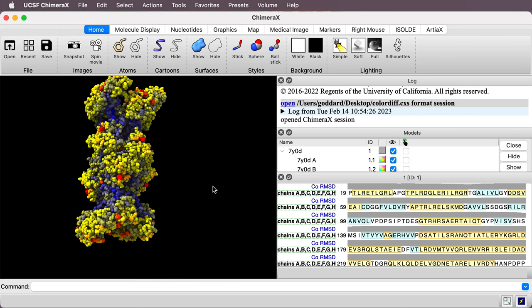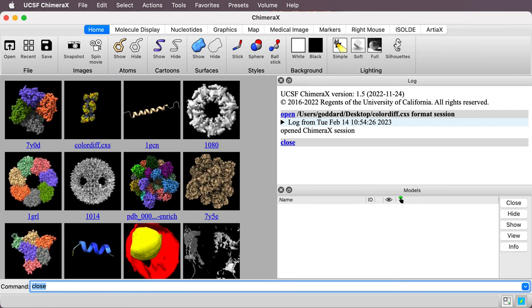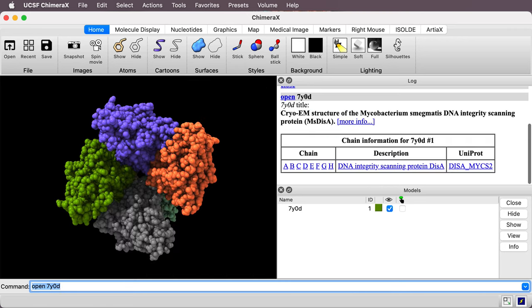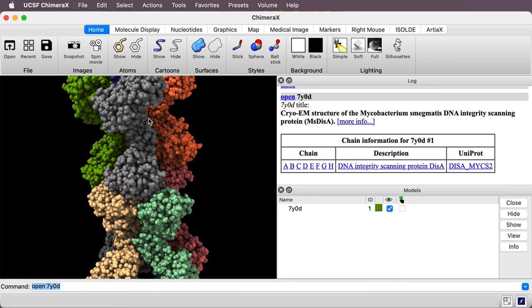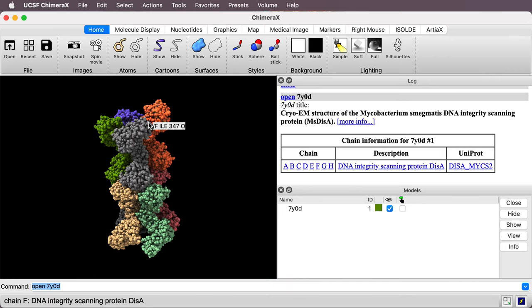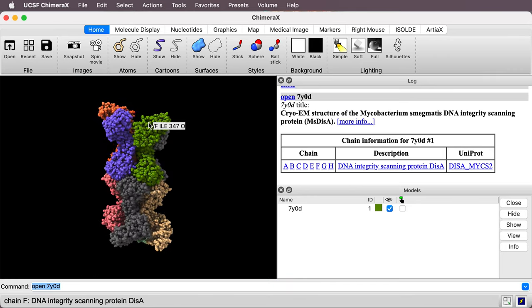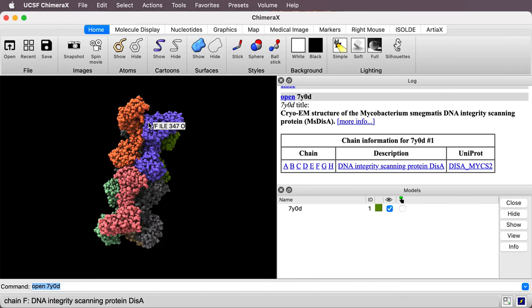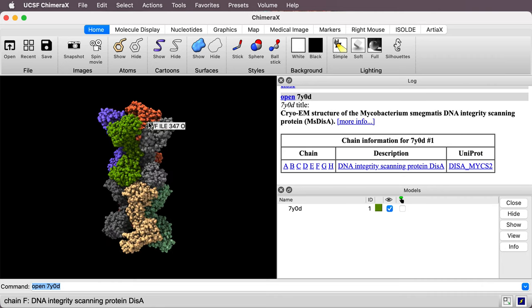All right so let's take a look at how to do this. I'm going to close this and we'll do it from the start. So I'll open the PDB model 7Y0D. So here each of the eight copies are given a different color.